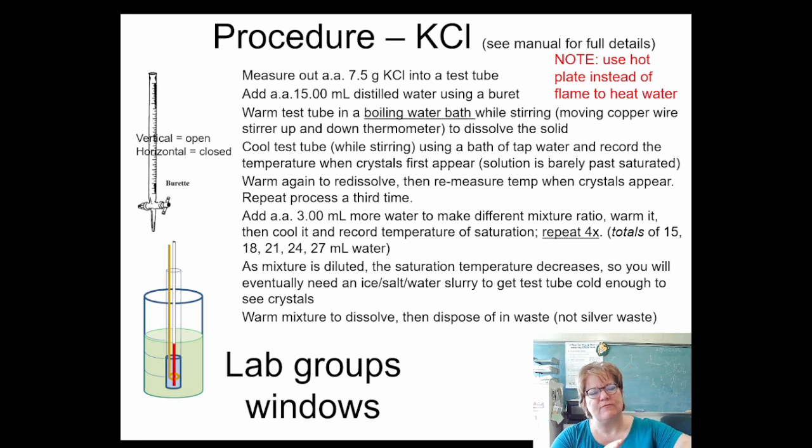When you get down to the final two temperatures, final one, you'll probably need an ice water bath. If you have to go below 0, ice water can only get to 0 degrees Celsius. We have some negative Celsius crystallization temperatures. You may have to go to an ice salt bath. That's really more with KNO3.